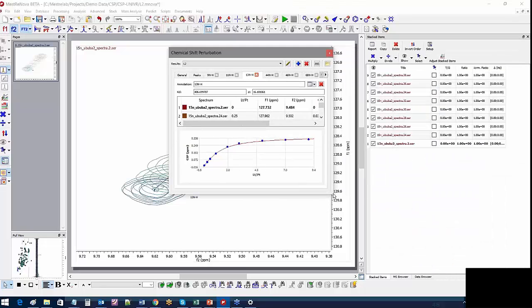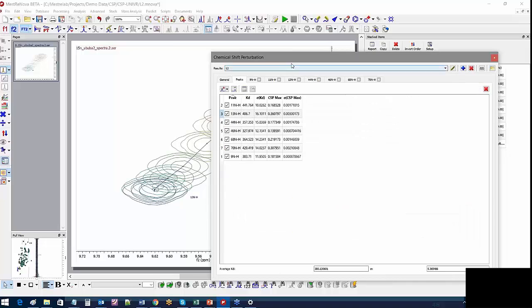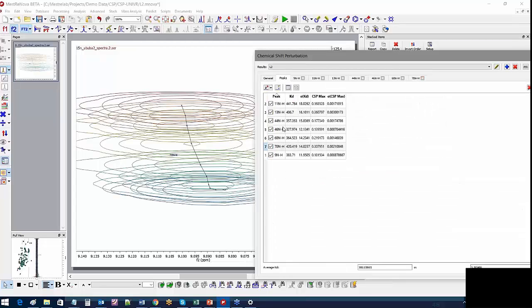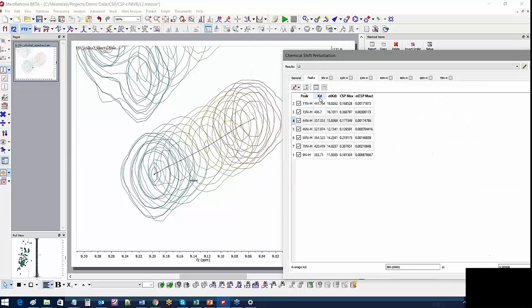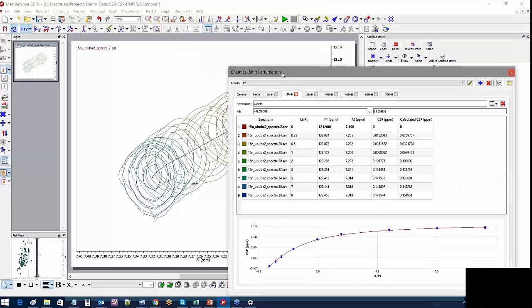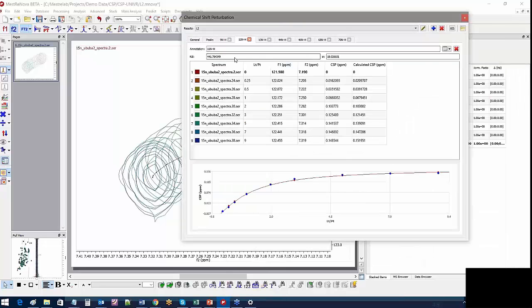And if you look at some others here, some of them are actually quite crowded regions, and still Mnova found the right changes of the chemical shifts. Anyway, yeah. So that's what I would show you as the automatic process and analysis. And for all of them, you see there's an average.